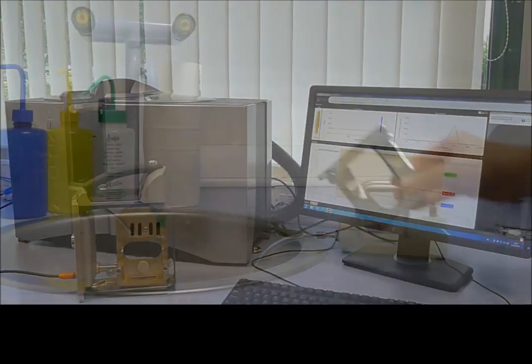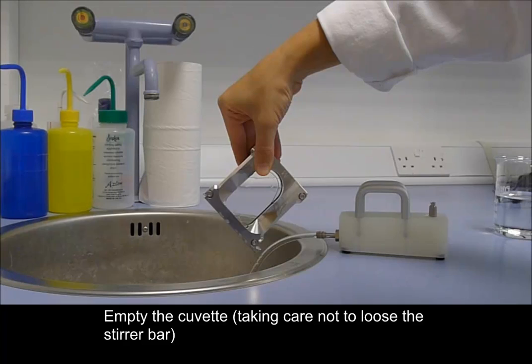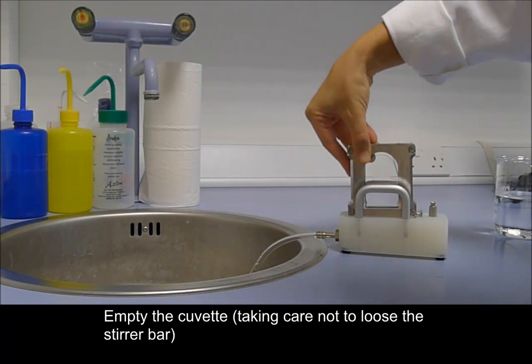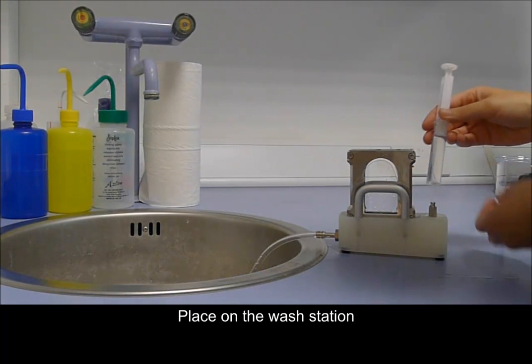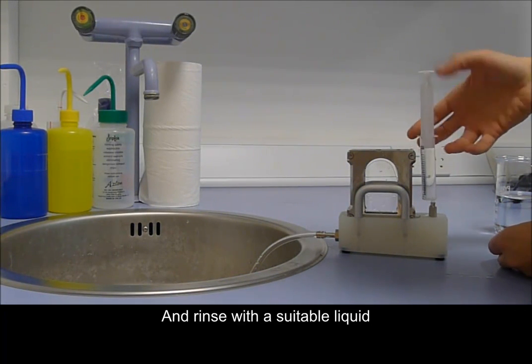Once removed, we can empty out the cuvette, taking care not to lose the stirrer bar, and then place the empty cuvette onto the wash station. The wash station can then be used to rinse the cuvette with a suitable liquid.